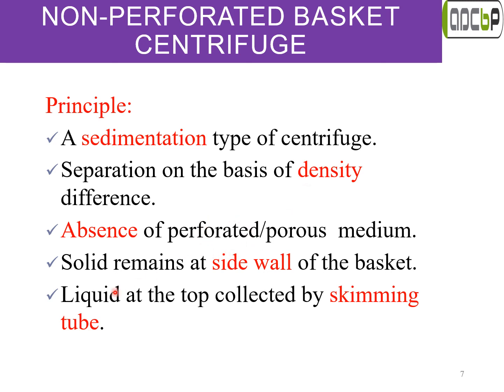If we consider a slurry which is being separated, under the centrifugal force, solid, because it is high in density, will get pushed to the side wall, whereas the liquid being less in density will experience less centrifugal force and will be present at the top of the solid residue, which is easily removed or collected by skimming tube, and after removal of the liquid, solid can be easily removed.